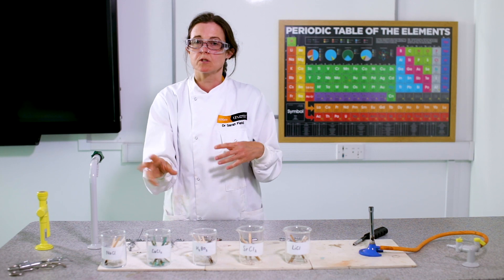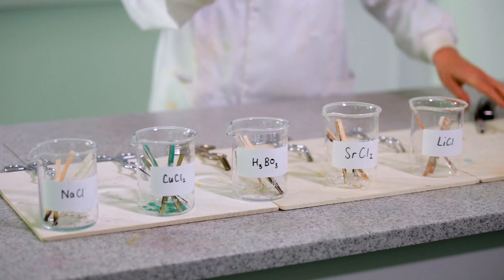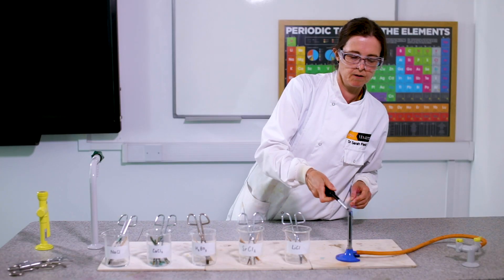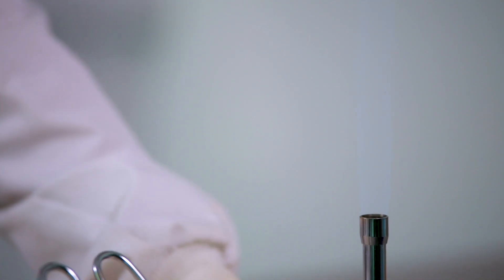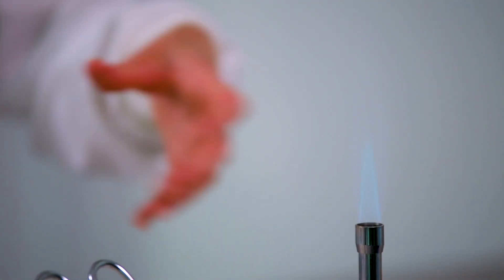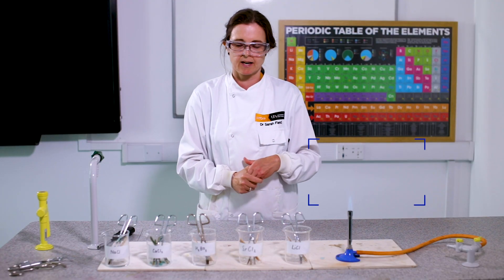The electrons are really important because they're the things that are going to cause the colors. I'm going to turn on the Bunsen flame — some gas is coming through. We're getting a nice yellow flame because the gas is burning without enough oxygen. If I open the bottom to add in more oxygen, we get a really nice blue flame, and this is the same kind of gas as you would have in a gas cooker.